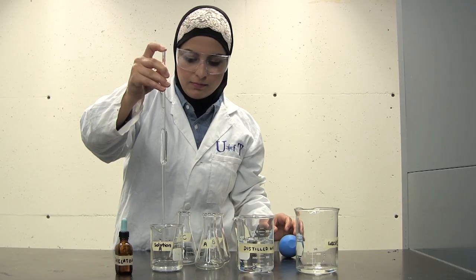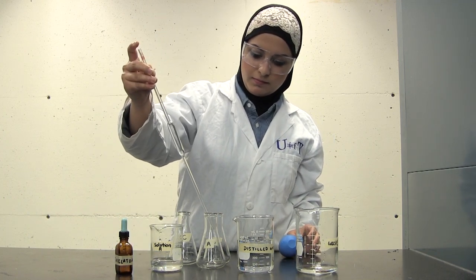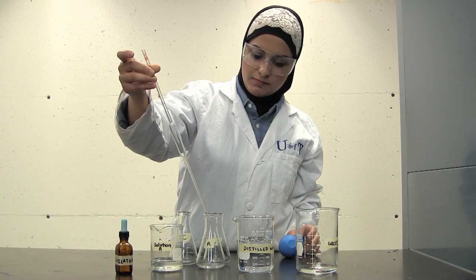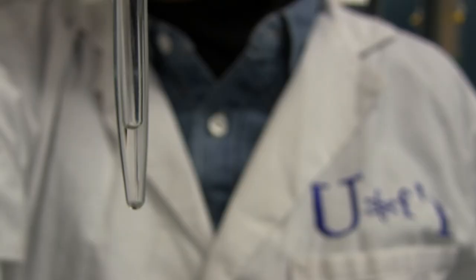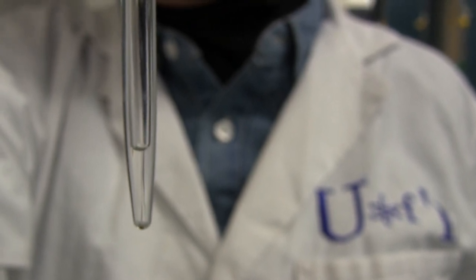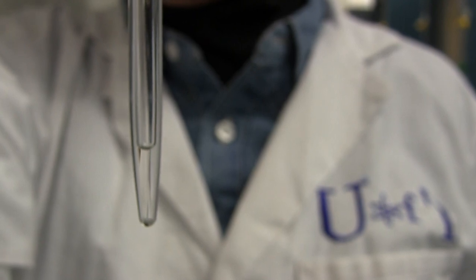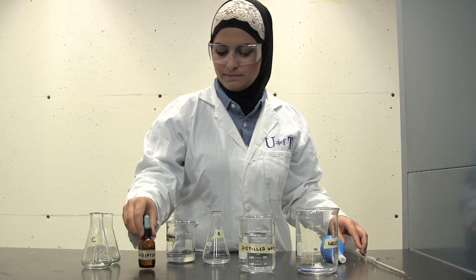Hold the pipette vertically and place it into the Erlenmeyer flask and let it drain. Touch the tip of the pipette to the side of the flask to break the surface tension. Do not blow out the pipette or shake it after the liquid has drained out. The pipette is calibrated to include the small amount of liquid left in the tip. The flask does not have to be dry for the solution to be transferred, however it must be clean.